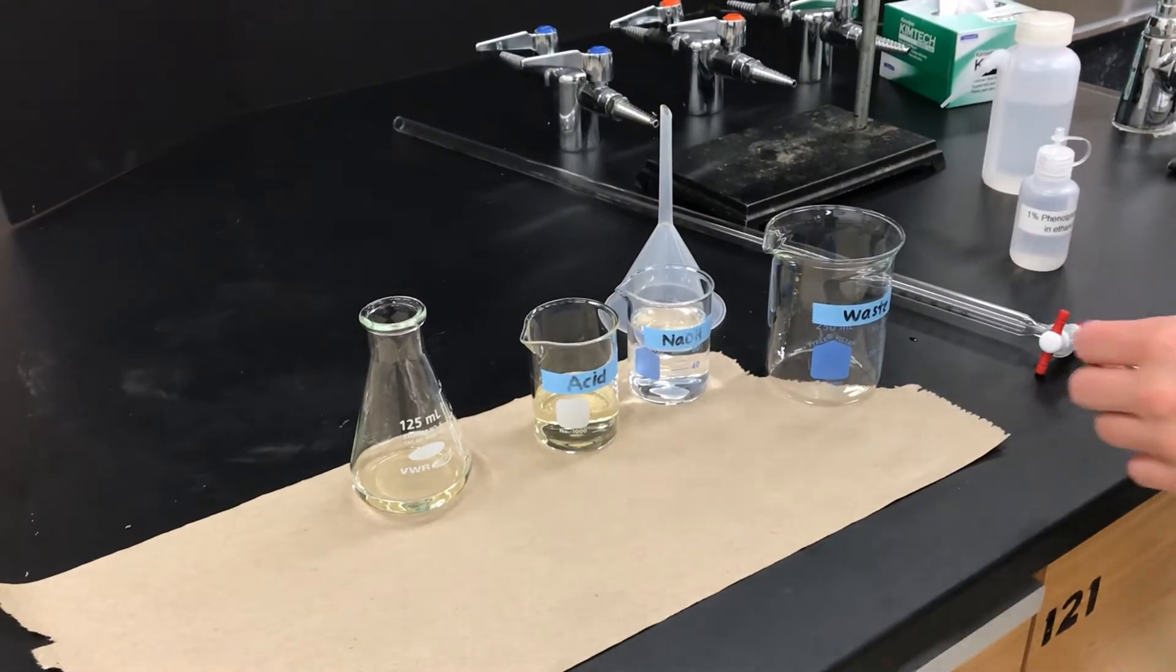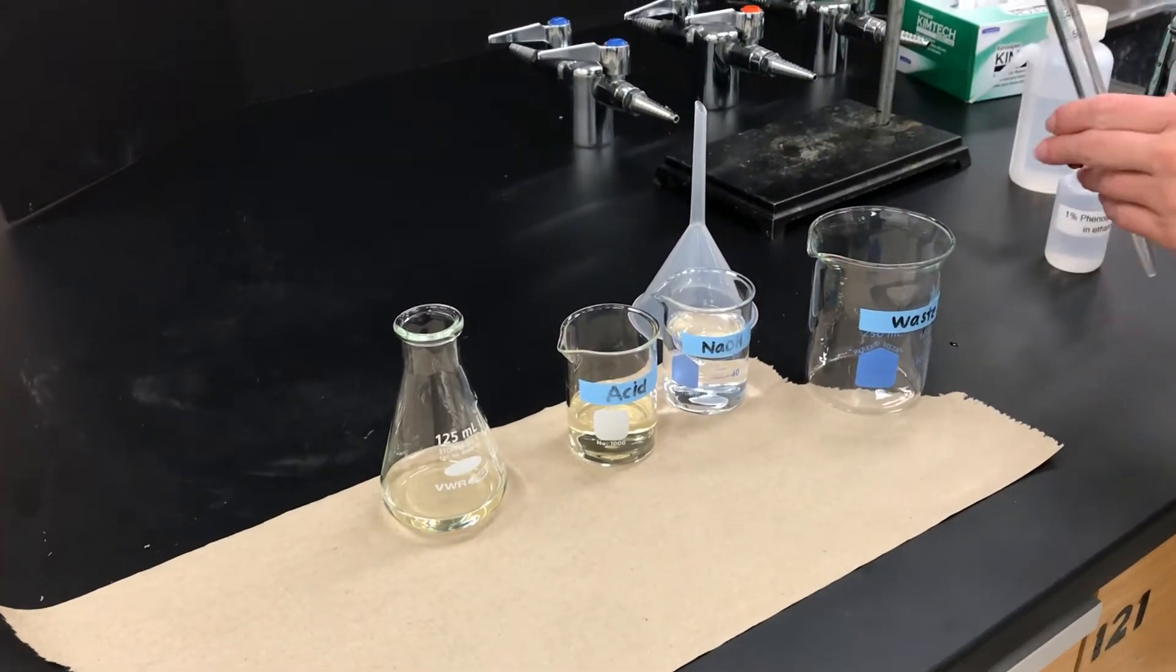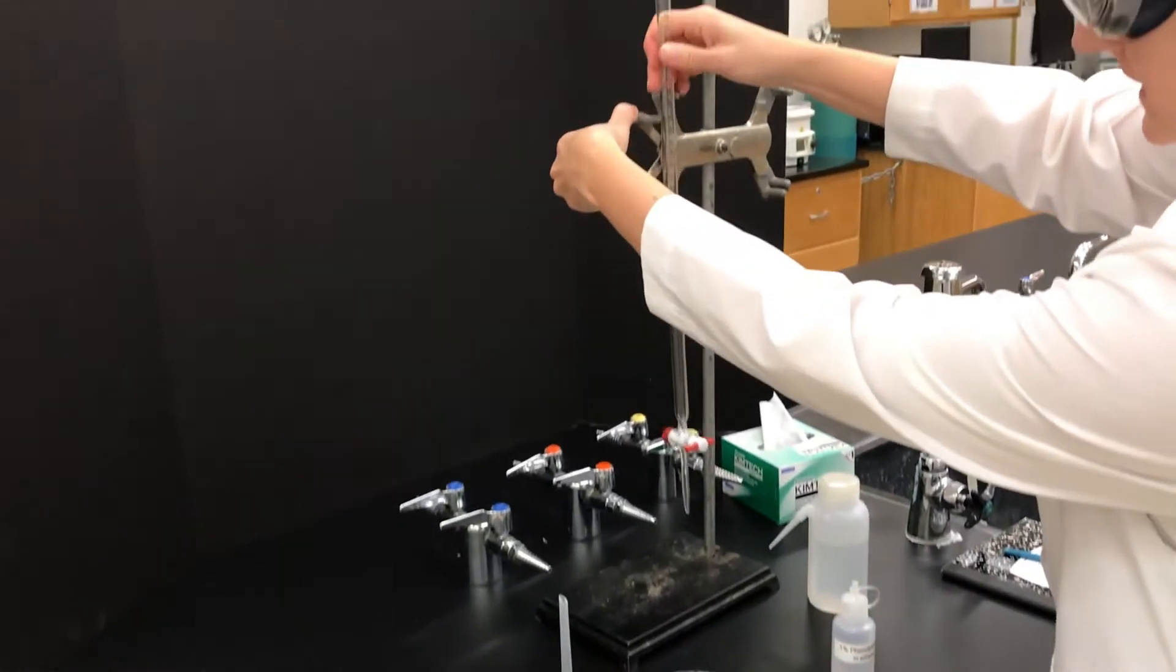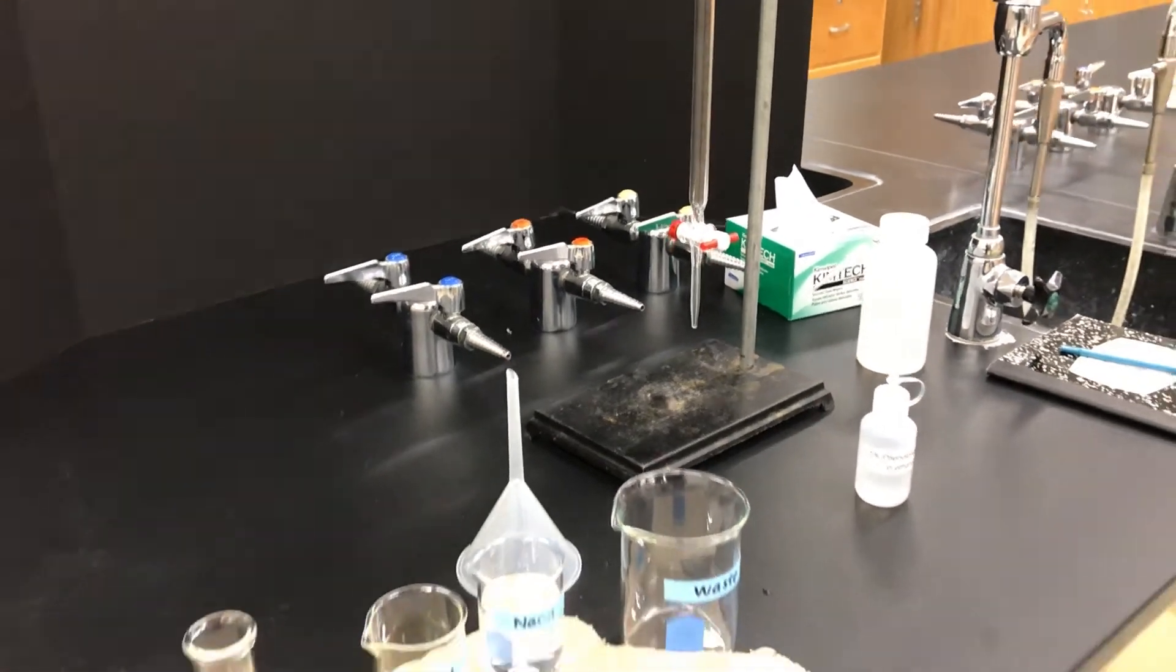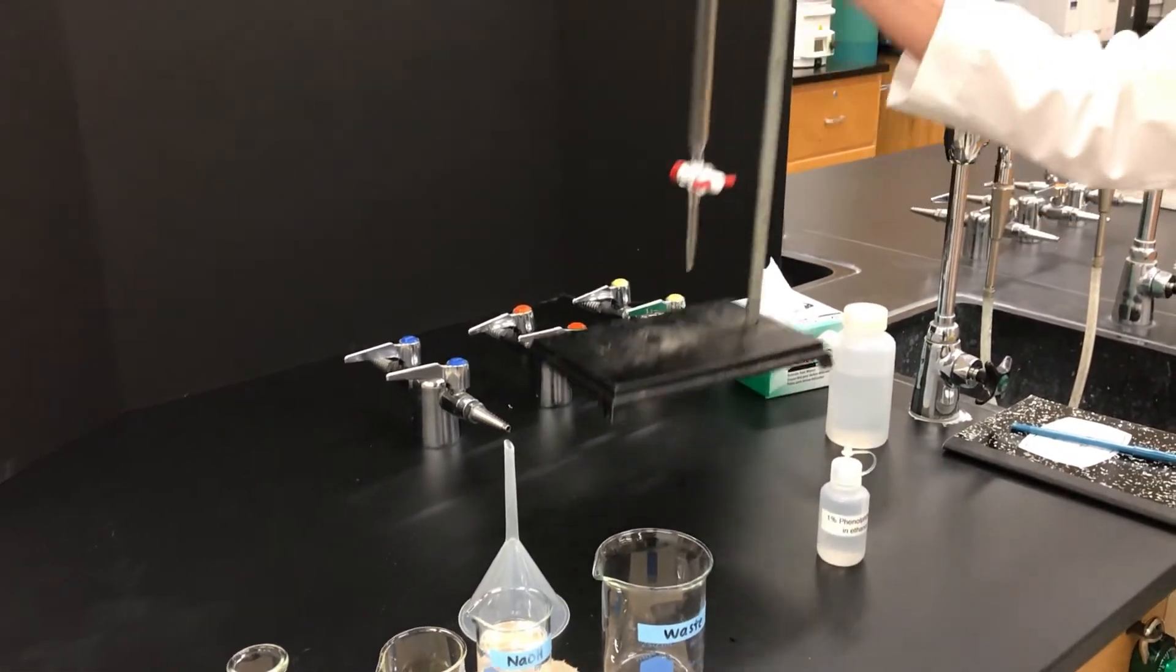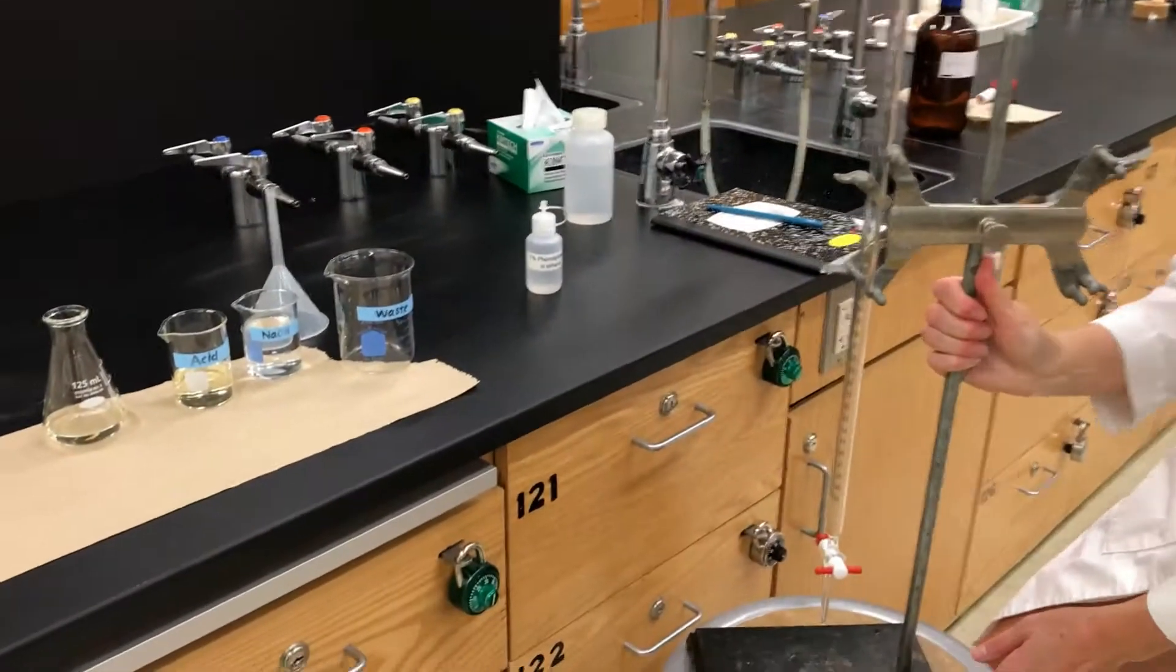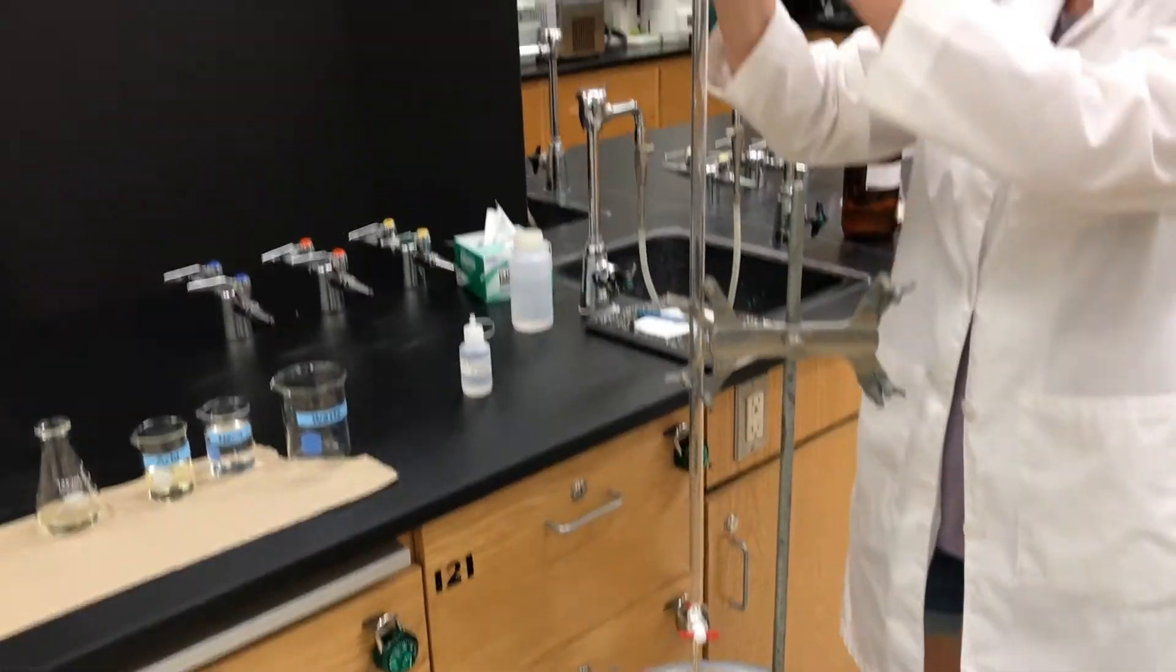Next we'll get our burette ready and secure it to a ring stand using a burette clamp. Because it's such a tall piece of glassware, often I bring it down onto a chair so that you can pour more at eye level instead of really straining your hand.